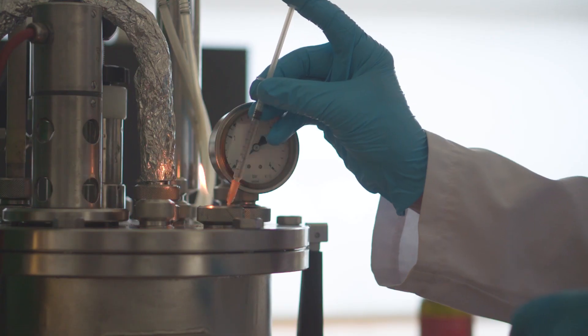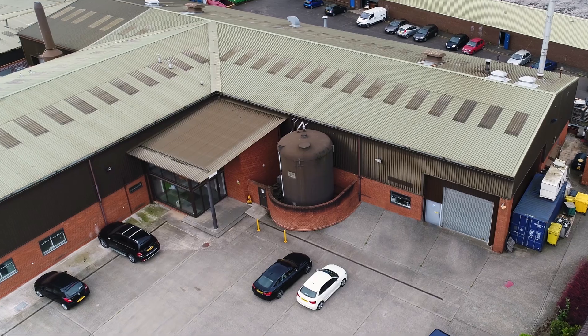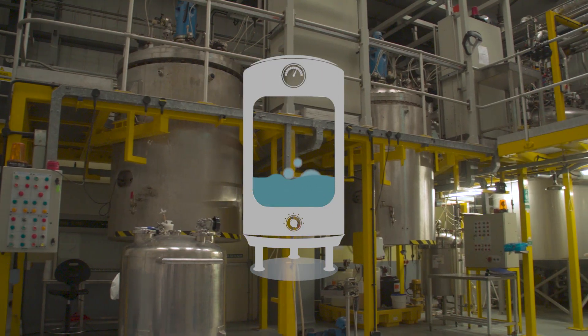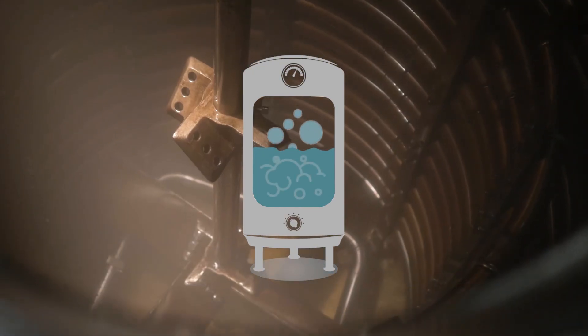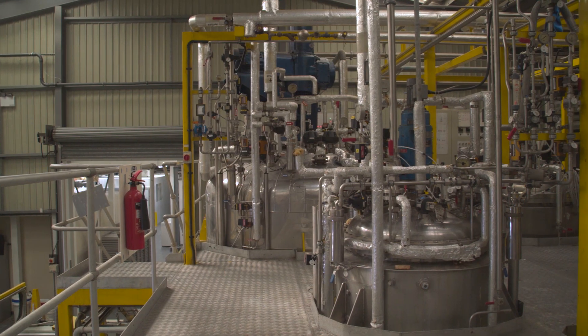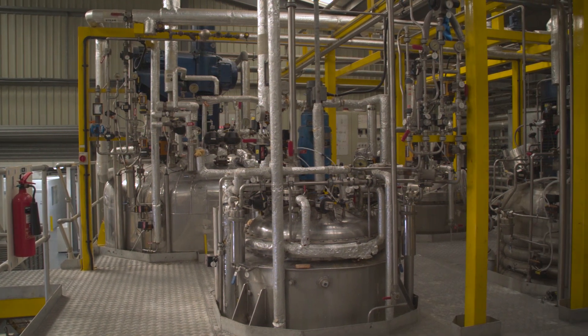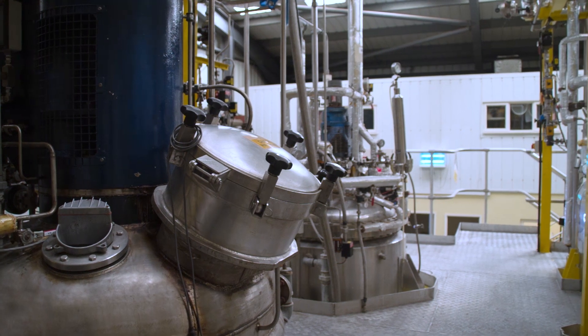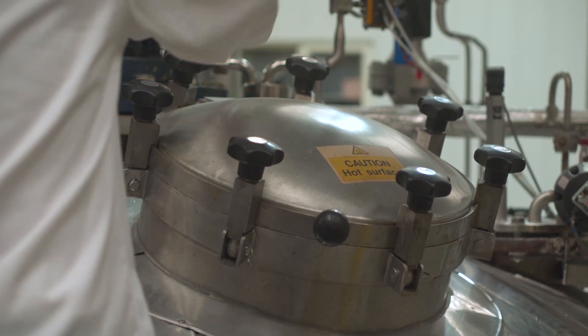This is left for a specific time period to allow the bacteria to multiply to the correct level. Once completed, this will be used to seed a much bigger fermenter. At this site we have a variety of fermenters in sizes ranging from 10 liters to 14,000 liters. Fermenters are specialized pressurized vessels which are used to multiply a bacterium into several trillion of the same bacterium. This is achieved using specific growth media dependent on the bacterium being grown, but all media contains liquid yeast extract, sugars, and minerals to varying levels, all of which are sterilized in the fermenters.